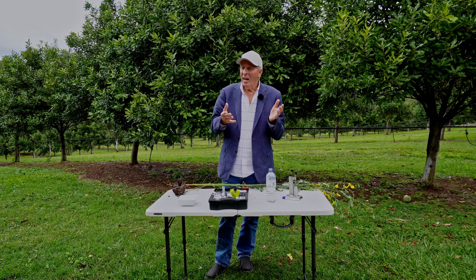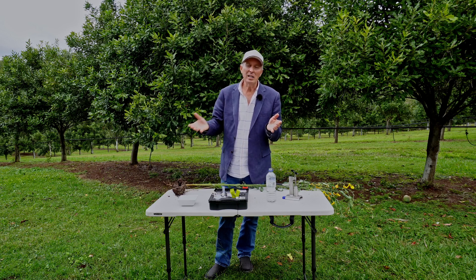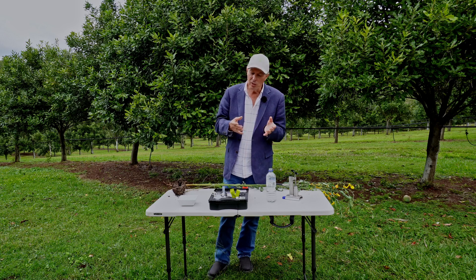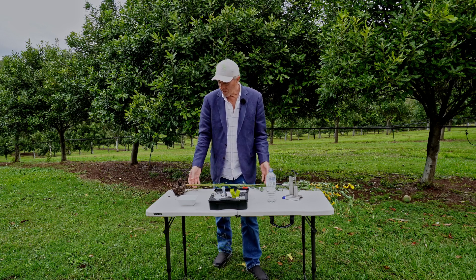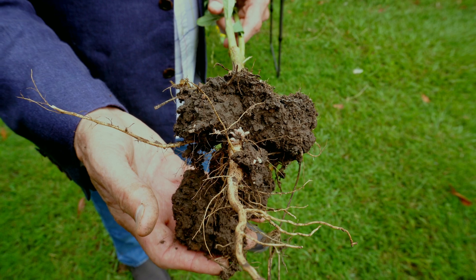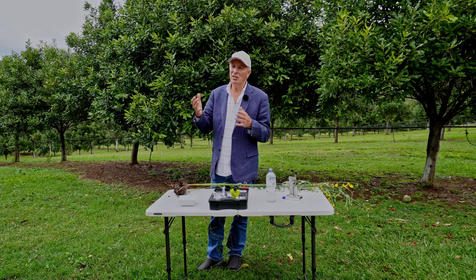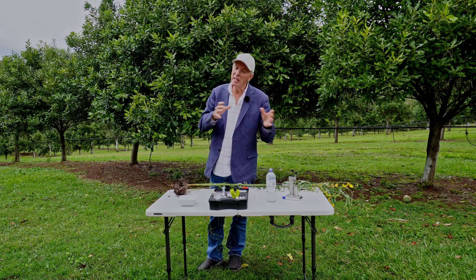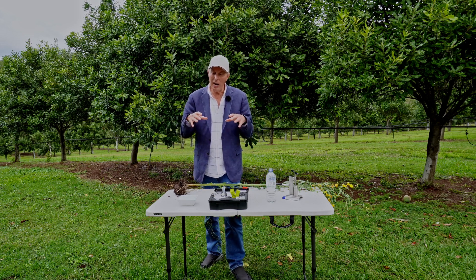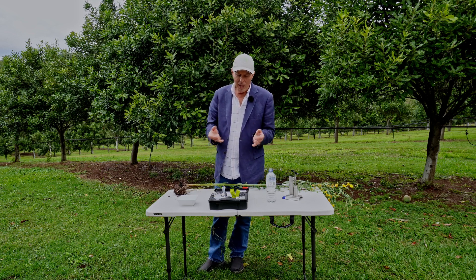Fungi don't like to be sliced and diced, they don't like fungicides, they don't particularly like herbicides — so we've knocked the hell out of that hugely important part of the soil food web. This meter will tell you: am I improving my fungi-to-bacteria ratio? Does humic acid increase the ratio? Does a cocktail cover crop improve it, particularly if there are some legumes? We're out at Collins Farm — this is sun hemp, part of his cover crop — and this is his beautiful crumbly soil.